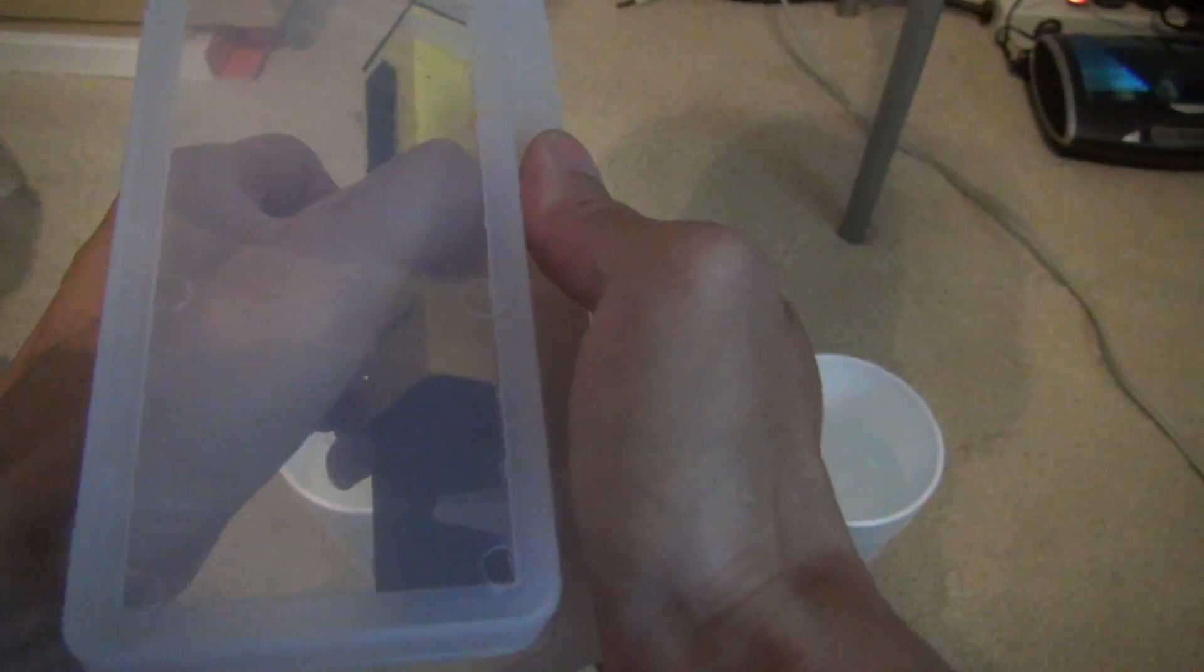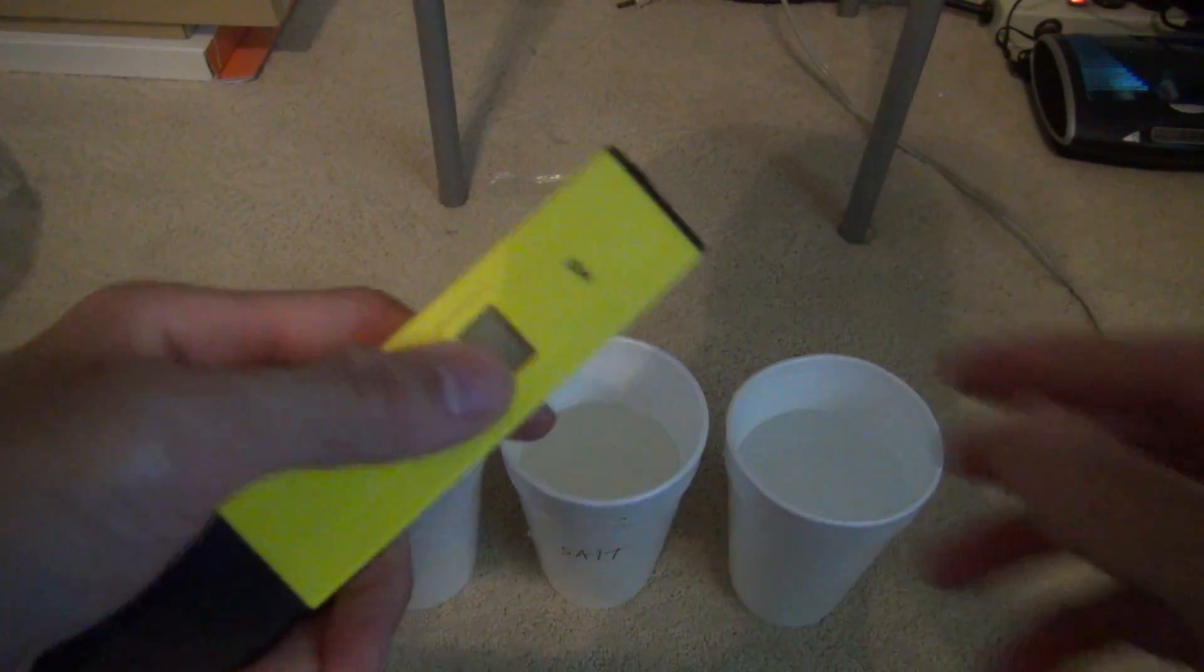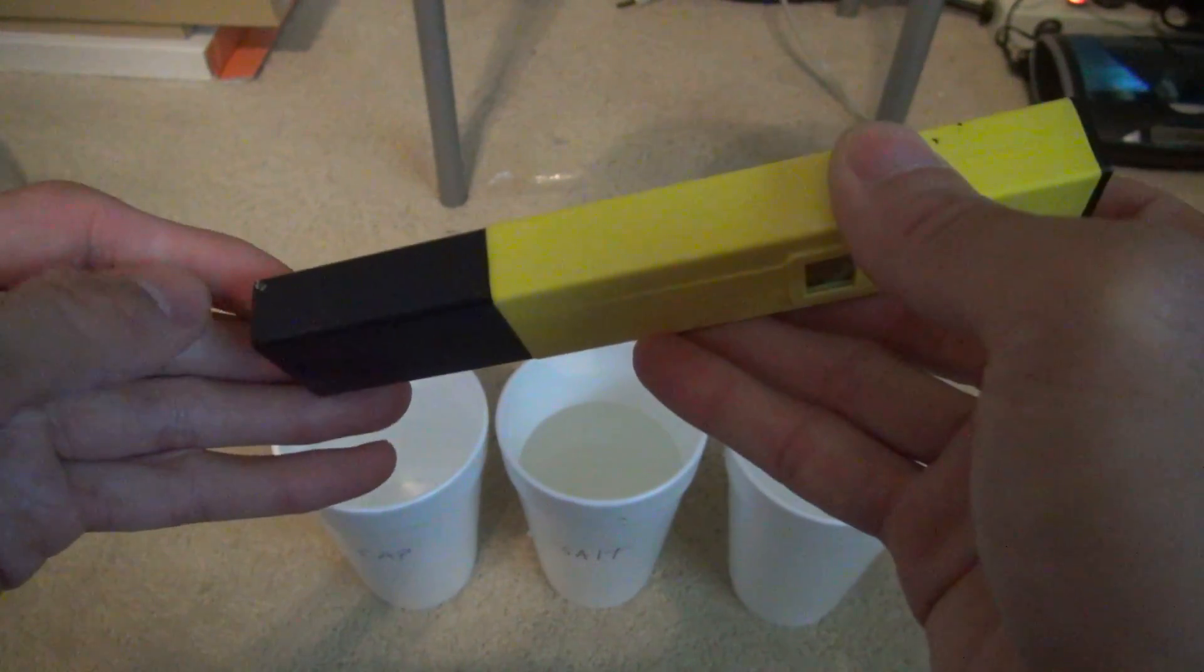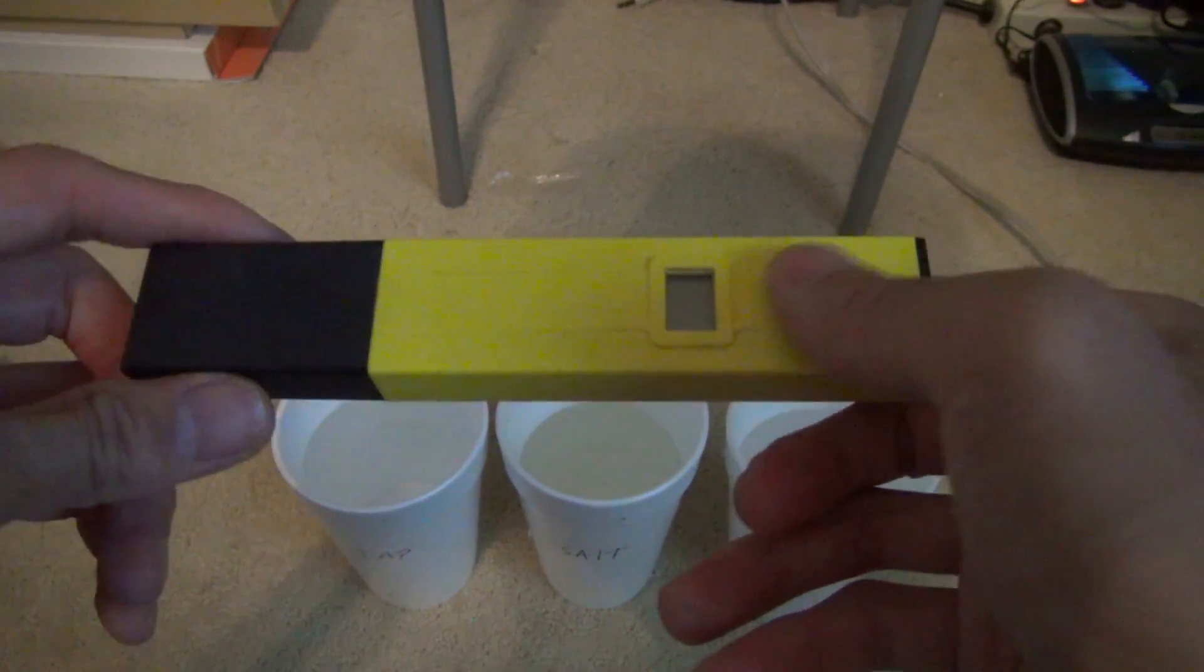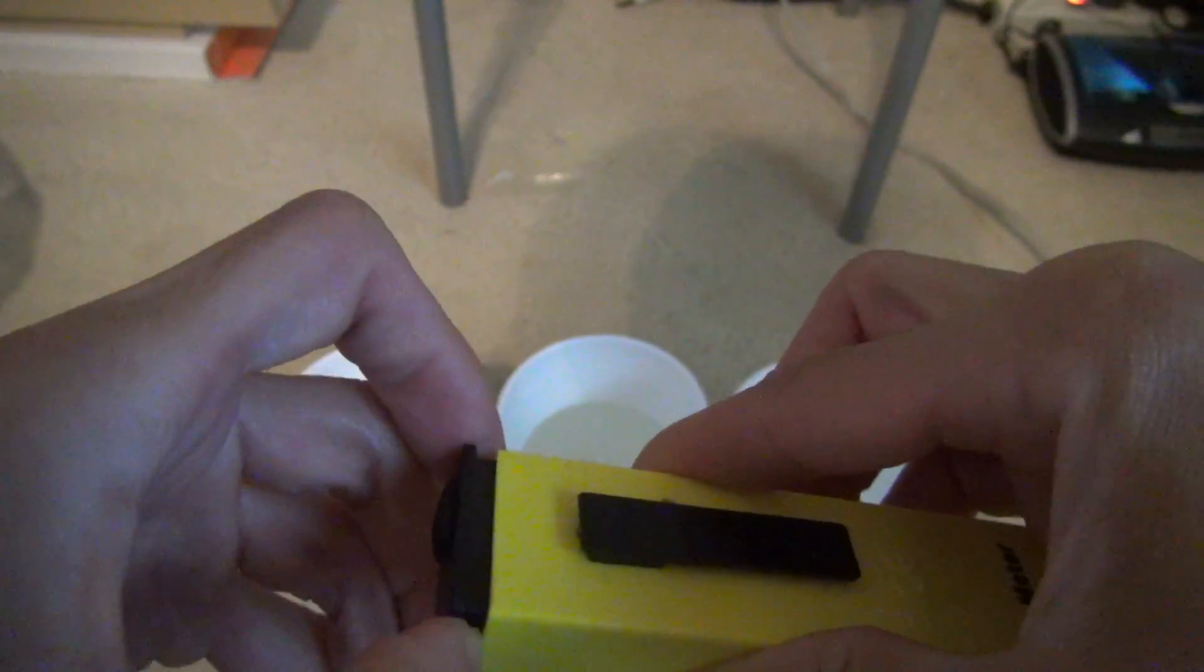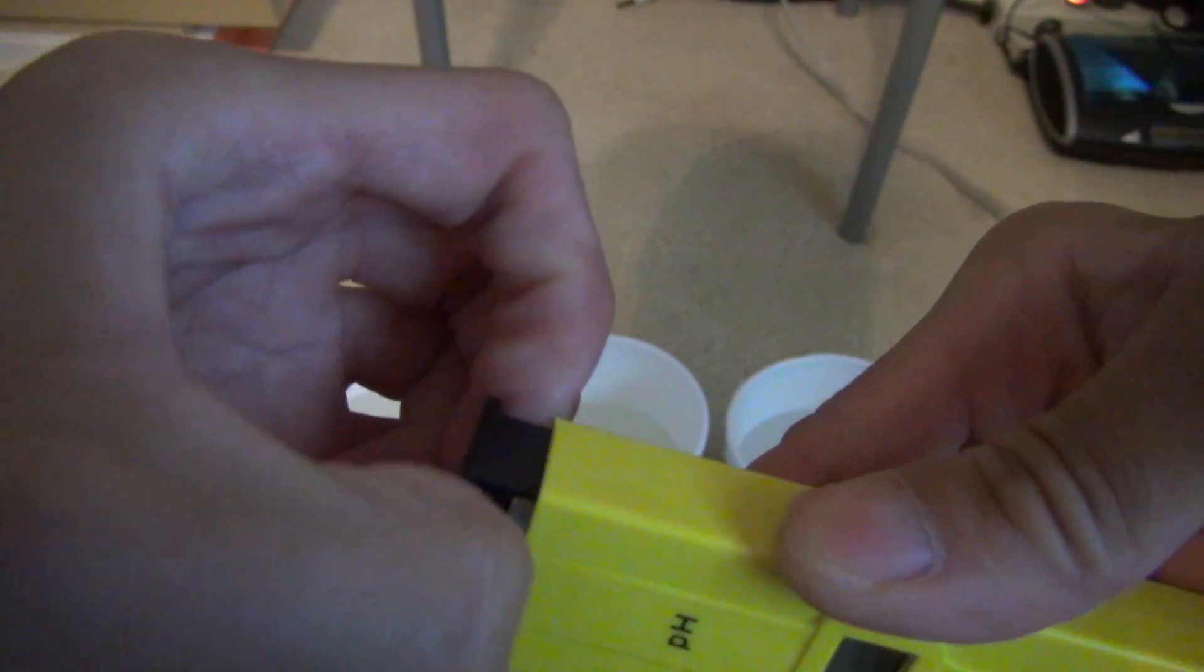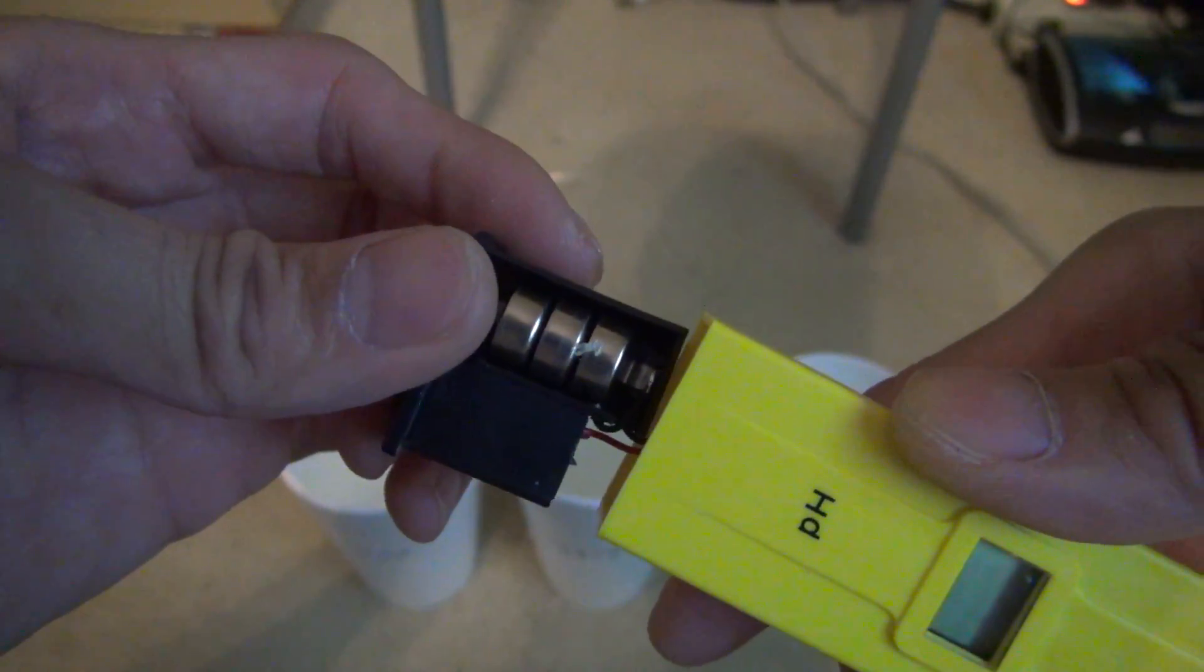I'm not going to adjust the meter. I'm just going to show you that it is working, to demonstrate what it's supposed to do. It has an LCD. It requires three button watch batteries that's included. Be careful when taking it out, you might break the wires.